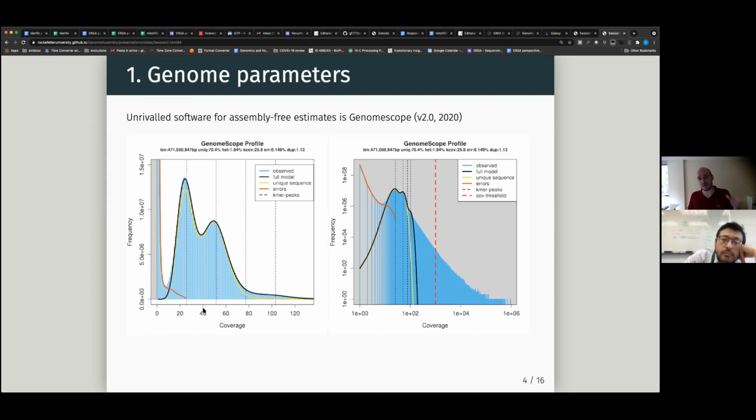To put it differently, if you have 2 K-Mers, each one is seen 20 times, you can now say, I see at the coverage of 20, I see 2 K-Mers, okay? And you can do the same for all the K-Mers that you have.